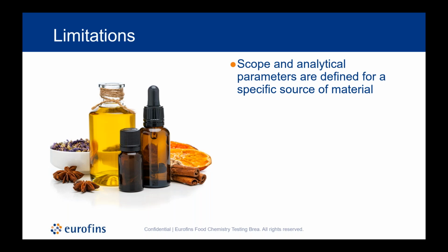The limitations, what we listed as an advantage, the scope, also becomes a limitation when we're talking about compendial ID testing, because that scope is only as broad as the validation data that was used to develop this method, and also only as broad as the materials and reference standards and the inputs that went into developing and validating that method.